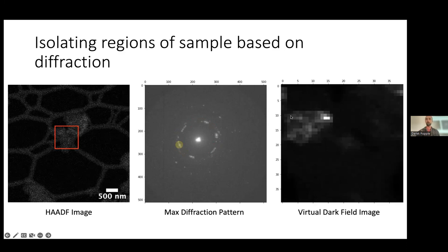What I just indicated was a little bit thicker, more strongly diffracting. So that's suggesting that this region of the crystal has a particular orientation, whereas other parts of the crystal may be twisted or oriented differently.